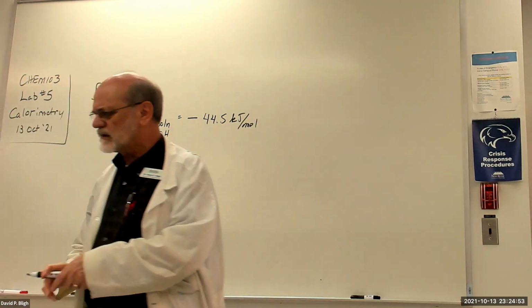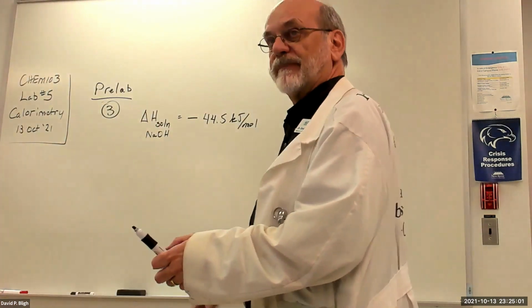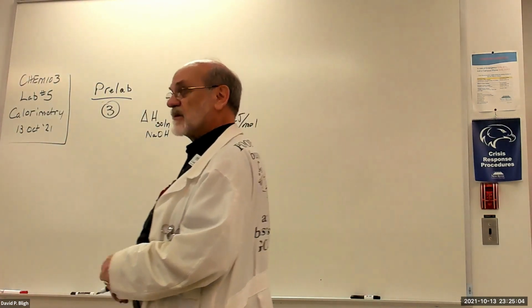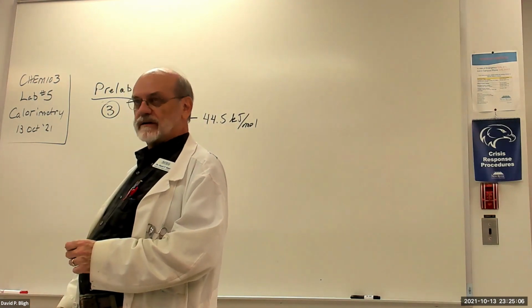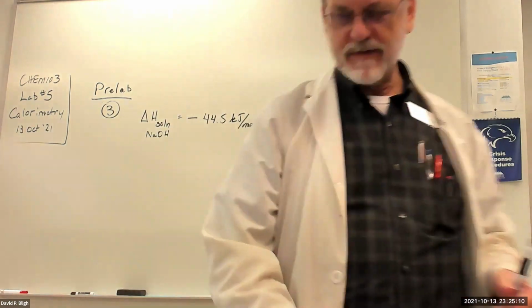Sodium hydroxide there. Thank you. Yep, I made that up yesterday from solid sodium hydroxide. It took 40 grams in 1 liter. You guys love... Oh, thank you. Sorry. Mine is that. Just thought I'd tell you.